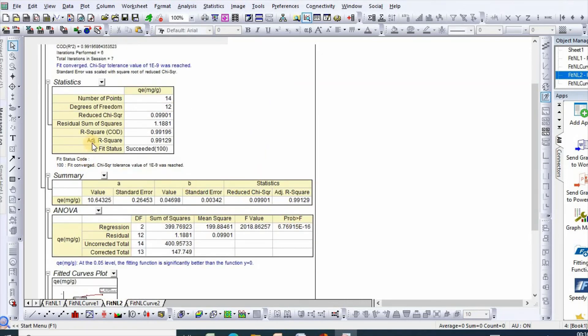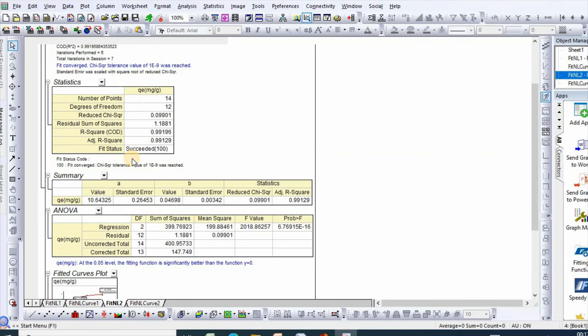So this is how we can perform error analysis for adsorption isotherm study using Origin software.